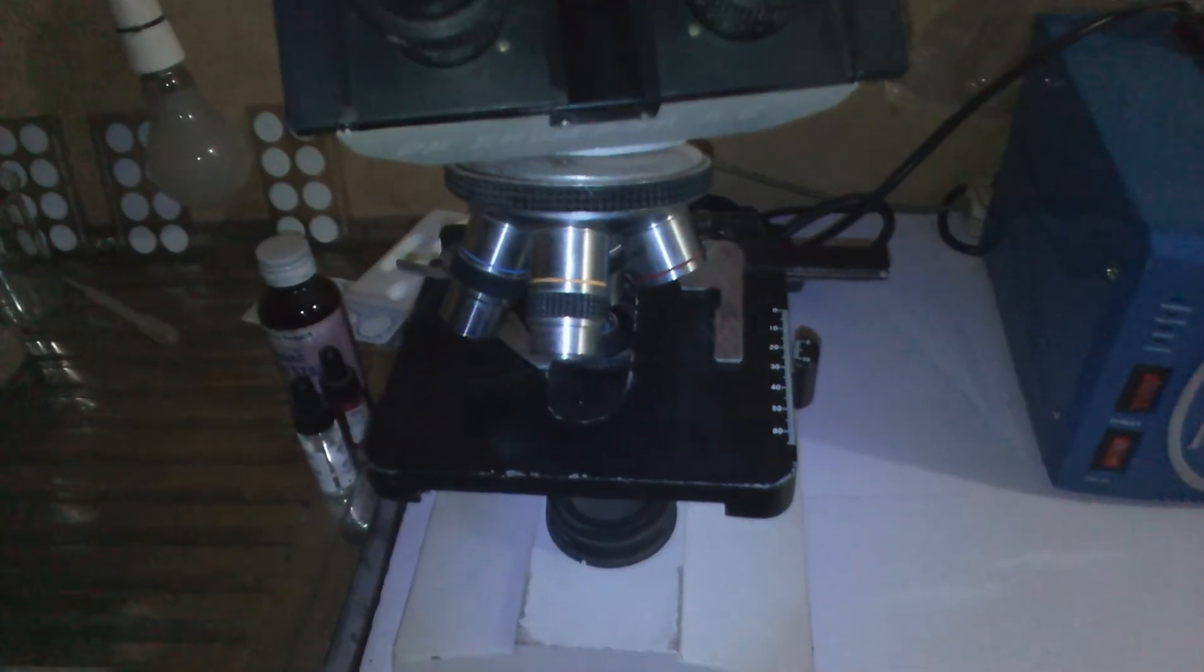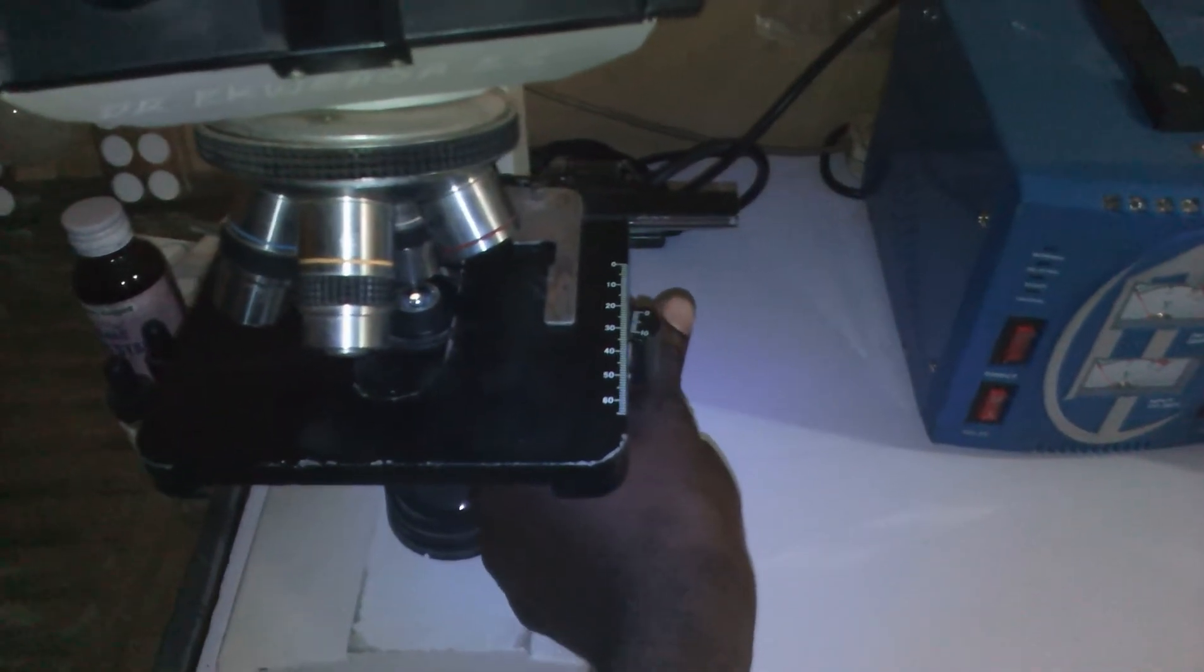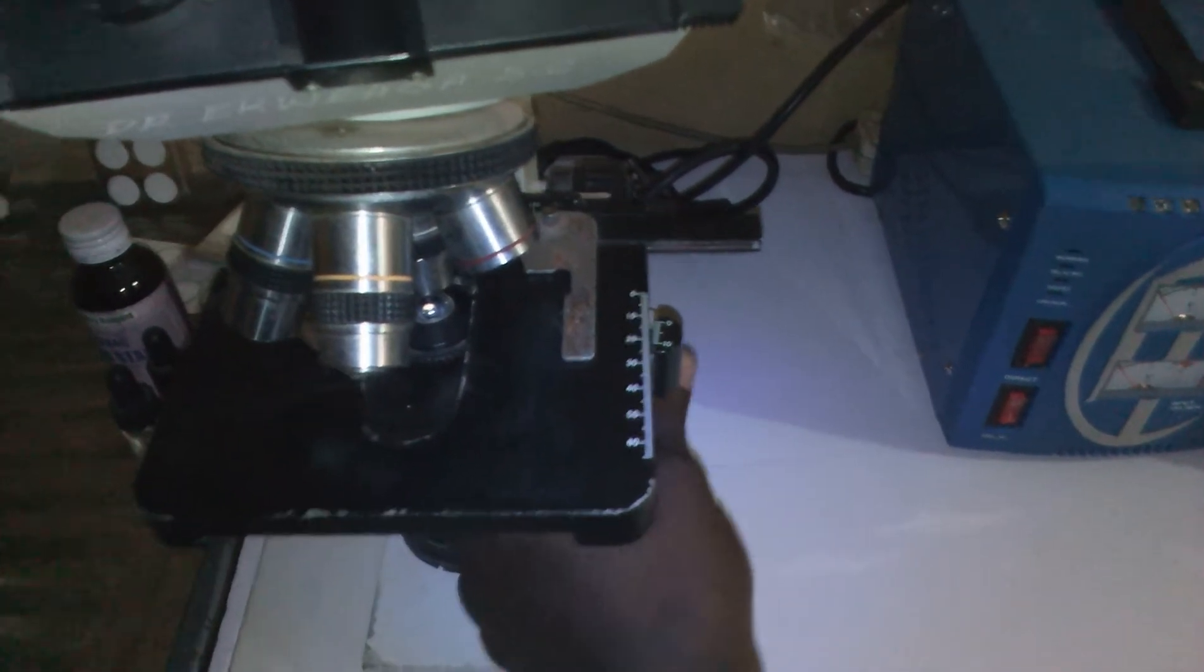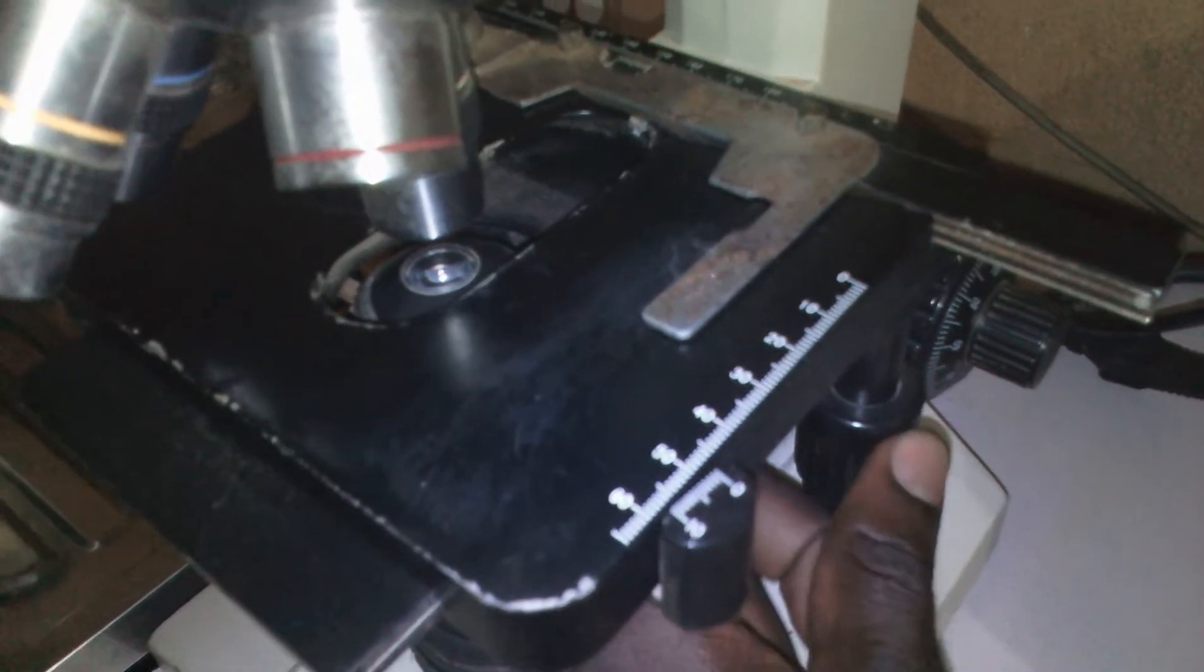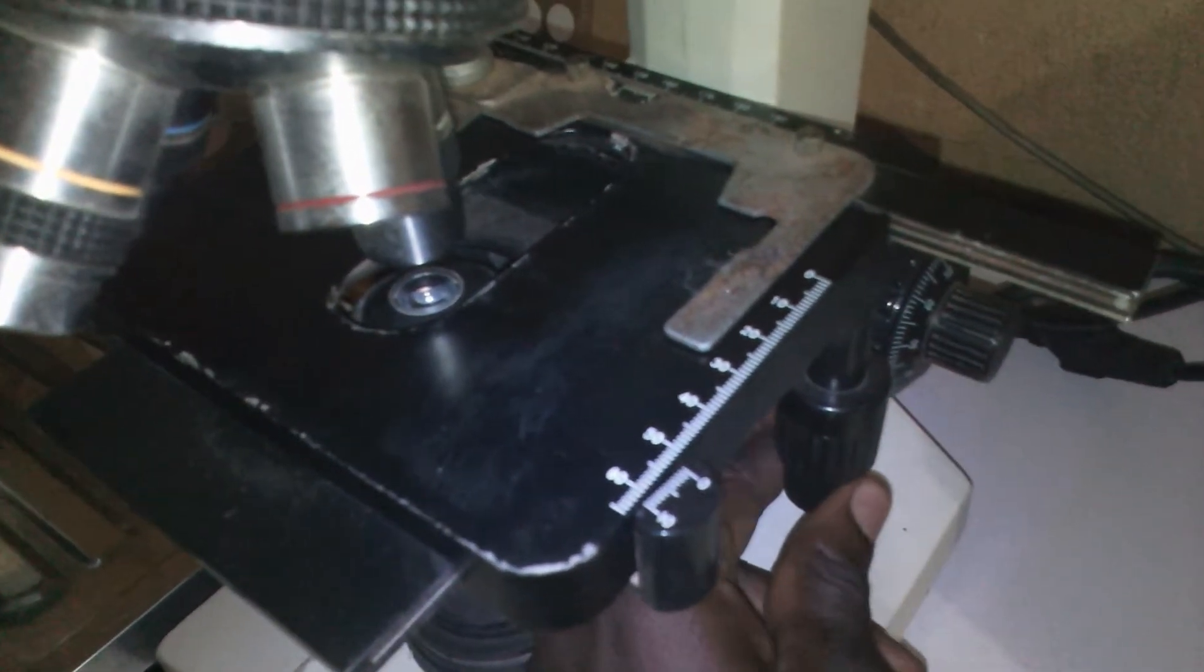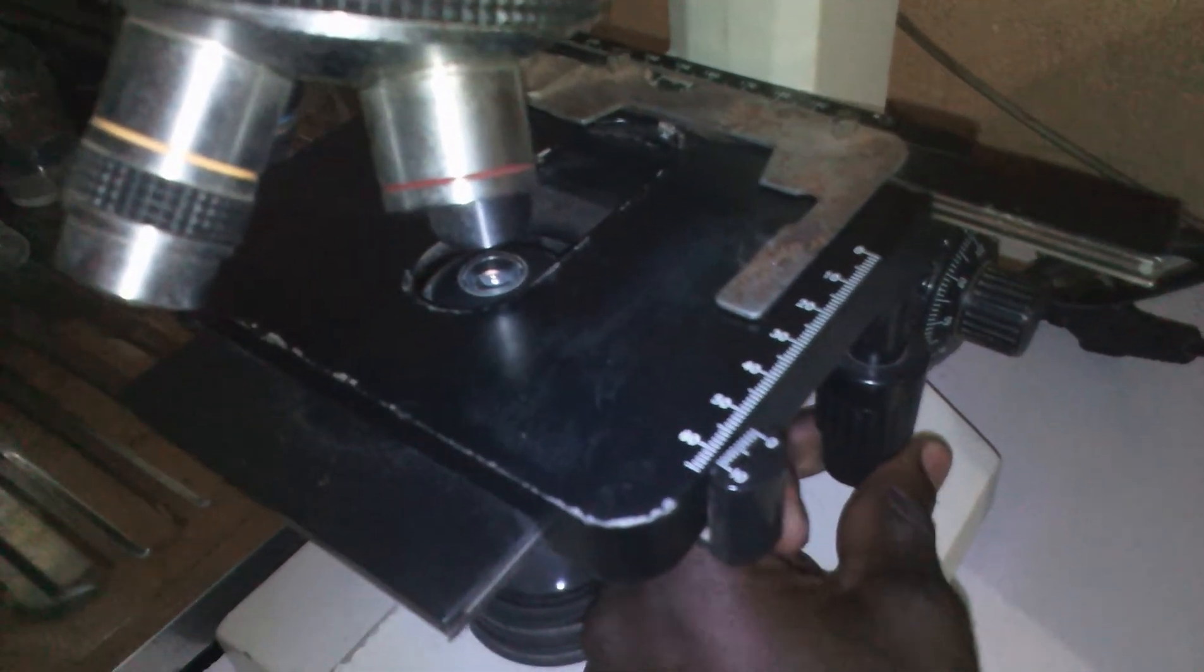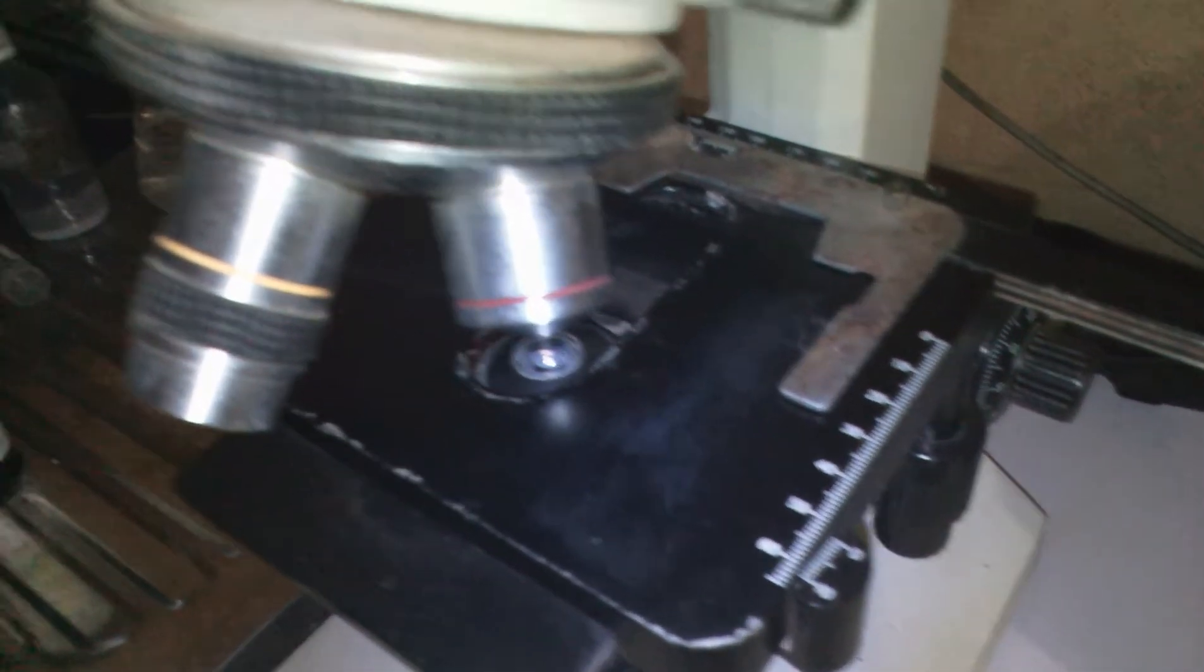This is used to adjust your base. You can move it forward, you can move it backward. You can see what I'm doing here, driving it backward. Now I want to shift it to the side. This is what you use to move your slide upward, for example.